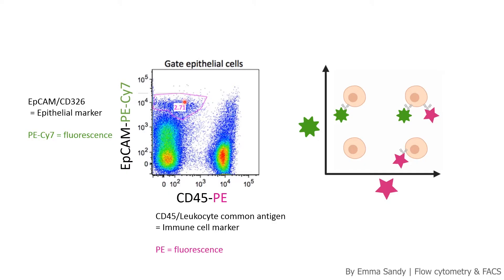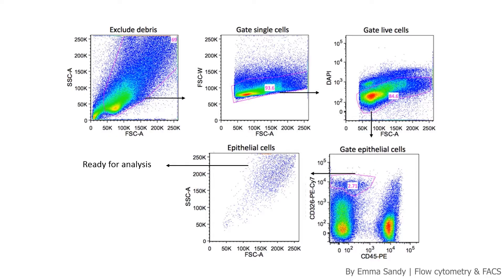With this two-parameter plot we can see cells that have neither marker down in the bottom left. We can also see some leukocytes which are positive for CD45 over here, and the epithelial cells I'm interested in which are EpCAM positive up here. At this point it's really good to go back and see what the cells you've selected actually look like — this is called backgating, where you take the cells of interest and put them back onto the very first forward scatter and side scatter plot. We can see that most of these lung epithelial cells are big and granular.